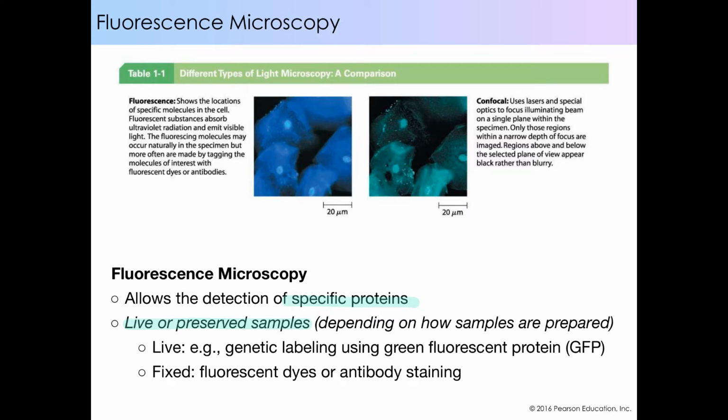That doesn't mean we're going to see the structure of the protein, but we will be able to see whether it's present in the cell or not, and we'll be able to label specific things, organelles, like the nucleus, for example, by labeling a protein that's present within those organelles.